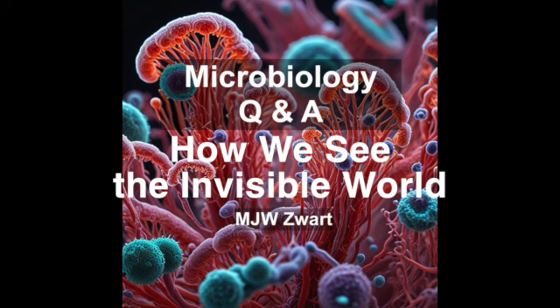First things first. How do microscopes actually work? Ah, the big question. It all begins with light. Understanding how it behaves is key. Think about a magnifying glass. It uses a simple convex lens to bend light rays, focusing them to enlarge the image. Like a super-powered magnifying glass. Exactly. But instead of a single lens, microscopes use a combination of lenses, carefully shaped to manipulate light in precise ways.